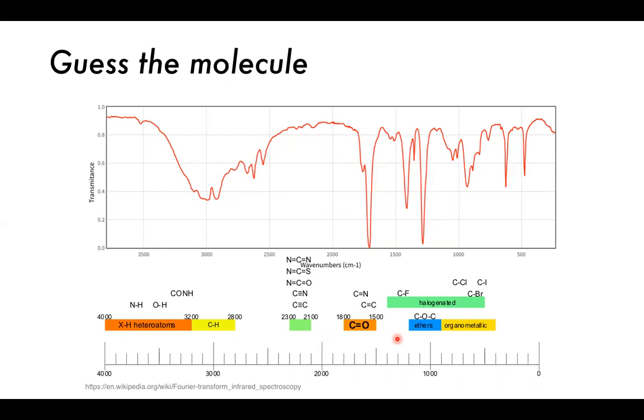Just try it. Pause the video for more time, and we'll have a little go. I'll give you an example. For example, in this region here, there aren't really any peaks. This is probably just noise.